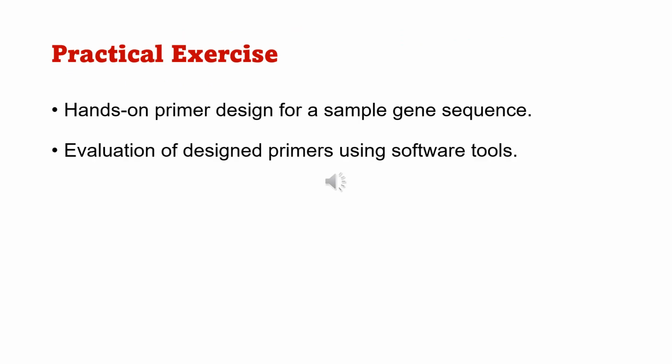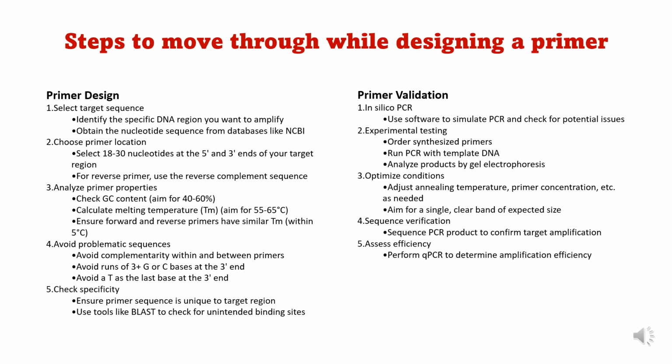Further, we will do some practical exercise where we'll do the hands-on primer design for some sample gene sequence, and we will evaluate the designed primers using software tools. So these are the common steps which we follow while designing a primer.